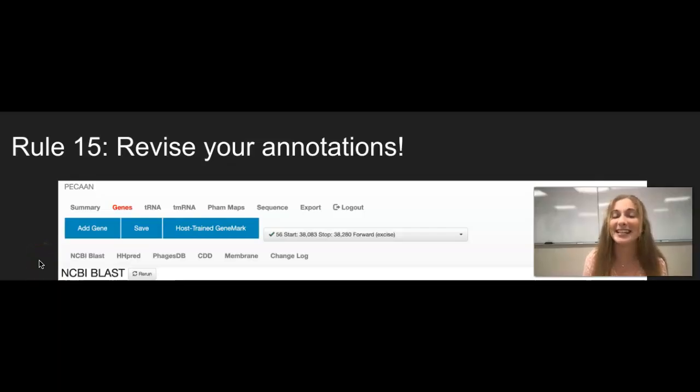And lastly, rule 15 stresses the importance and why we need to revise our annotations. As you annotate, make sure to go back and double check your work because it is very easy to make mistakes. Additionally, as you annotate, the functions of later genes can actually affect the functions of previous genes. So going back and double checking is a great way to fix any annotations that could be mistakes.